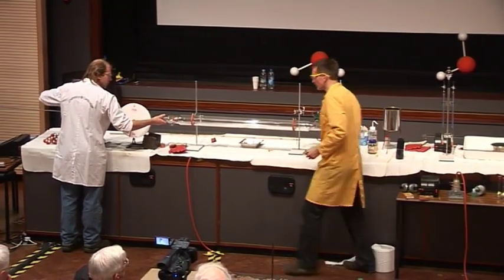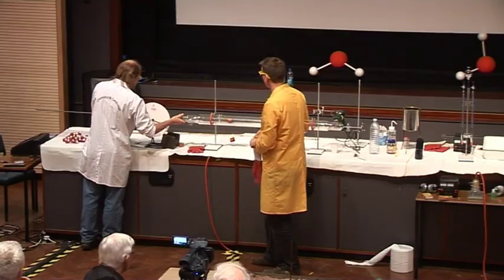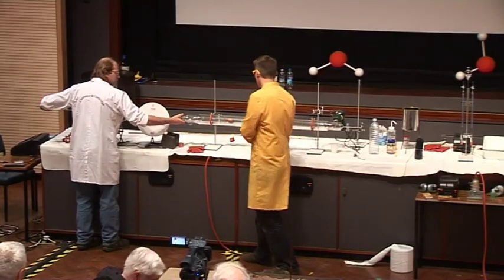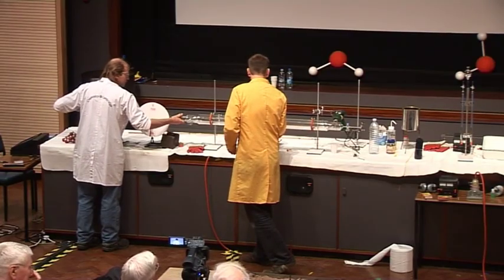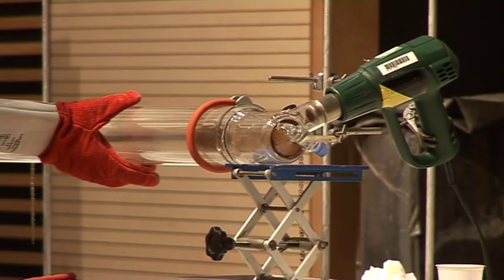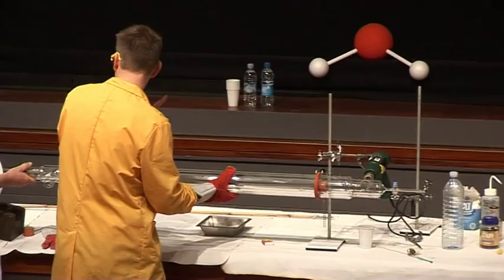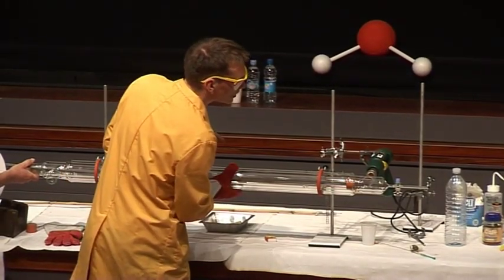Are you ready there, Chris? OK, so just put this in. So now this is a giant syringe here, made of glass, and we're heating this up to very high temperatures. OK. And in a second, we're going to inject into this just 1 milliliter of liquid water. Keep going. OK, that's good.